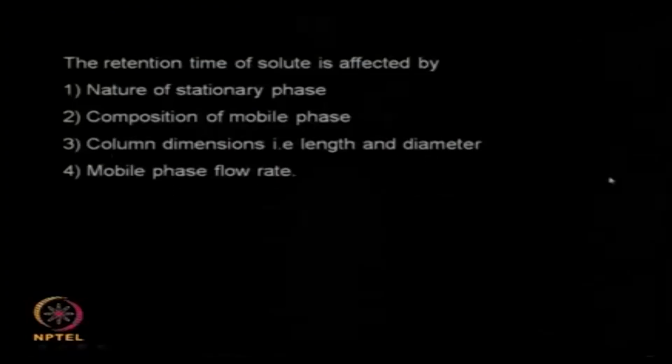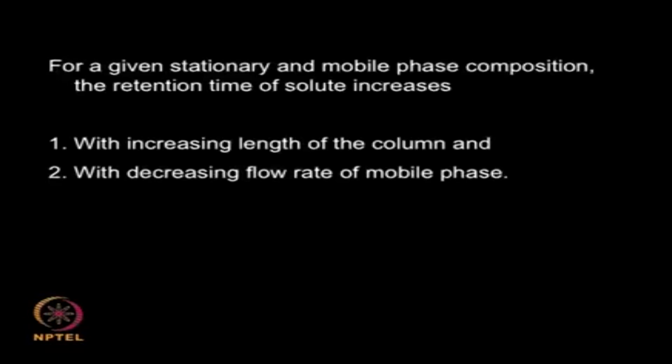Column dimensions, what is the length of the column, what is the diameter of the column, and finally the flow rate of the mobile phase, how fast or how slow the mobile phase is flowing. So all these parameters affect the movement of my solute through the column.